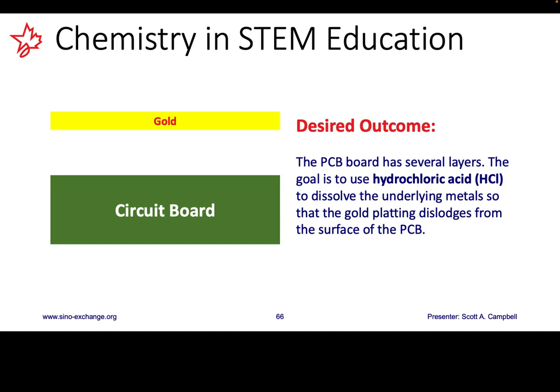Therefore, it would be practical to let the reaction go overnight, and then students can come back to the next step of the experiment the following day. At this point, the solution will have changed from a green to a dark black color. Add another 100 milliliters of hydrogen peroxide. This will act to further dilute the solution and to rejuvenate the chemical reaction. Repeat this process twice over a 72-hour period.